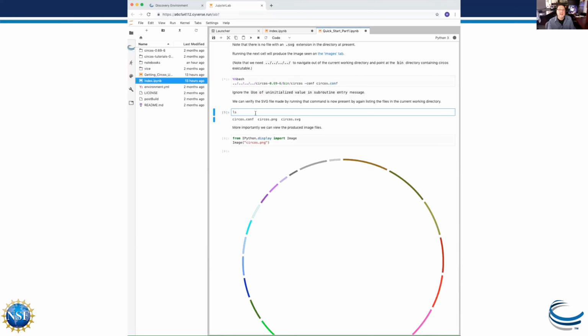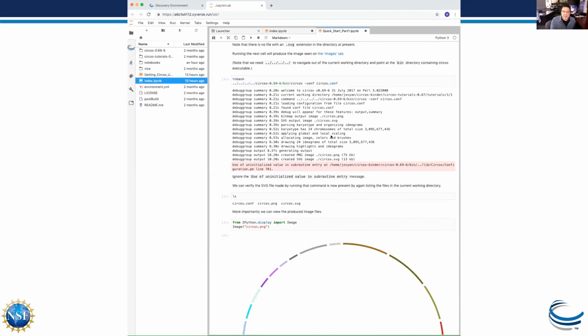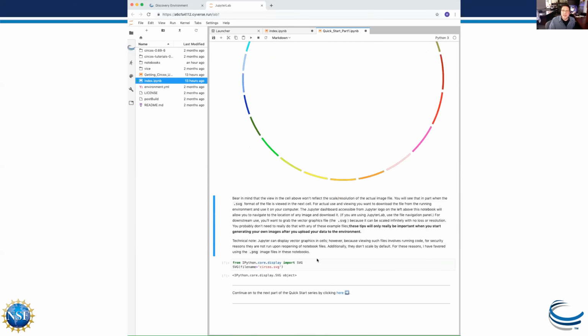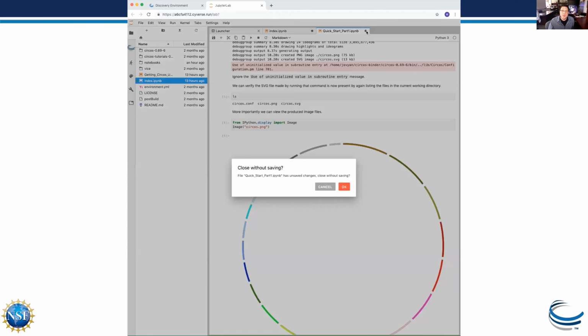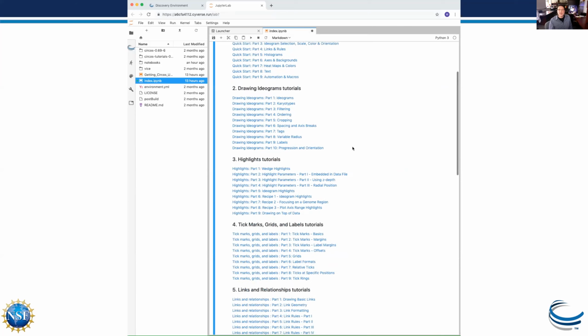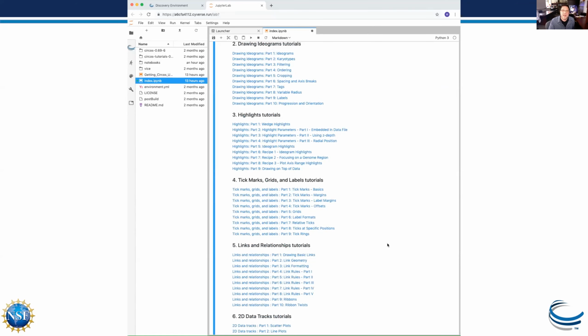And we can see that now when this finishes, which the asterisks will go away, we'll see that we have this file now, and we can actually, because of the greatness of Jupyter, look right at the file in here. And if we wanted to, we could look at the SVG. I don't do that in most of them because the files start to get large, which isn't a problem in CyVerse, but in the Binder system, it might be a problem.